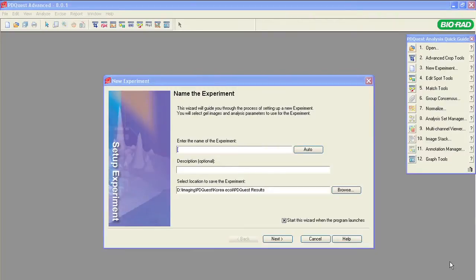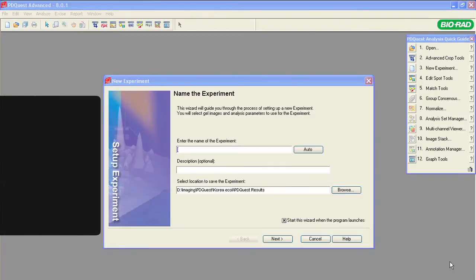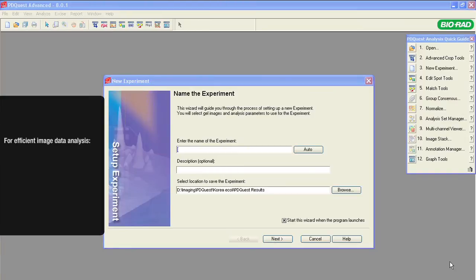In this tutorial, we will practice how to use the advanced crop tools to prepare images for efficient data analysis. When matching spots between the gels that you are analyzing within an experiment, it is important to have all the images the same size and shape.